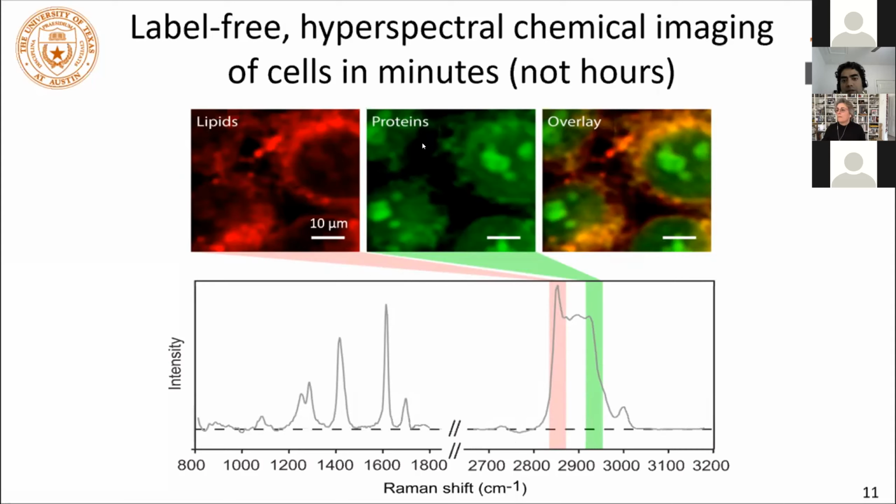And you see that they're not entirely overlapping in this particular fixed HeLa cell. If I overlay them, you can see what's where. You can also even see some protein condensation in the nucleus, probably from histones as well. So you now have the ability to look at entire macromolecular classes in a sample without any labels, and to visualize where they go.